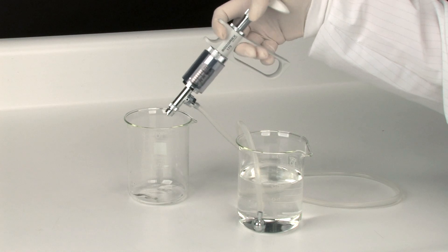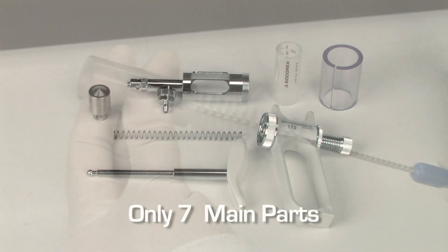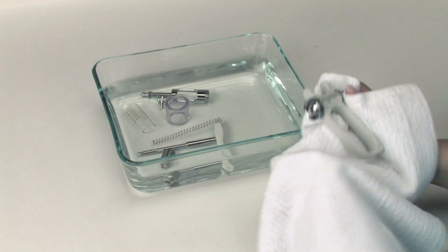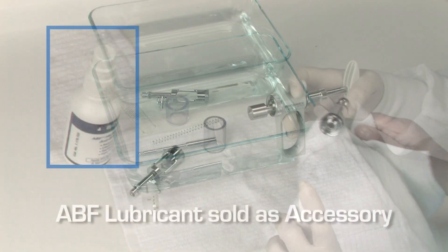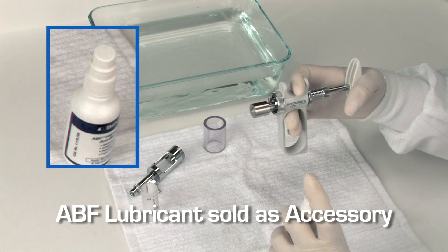After use, the syringe must be primed, then disassembled and cleaned. Dosus syringes can be disassembled without tools. Use a brush to clean the glass barrel. Make sure to dry all parts of the syringe prior to reassembling. Prior to reassembling, apply ABF lubricant to the plunger for added protection.